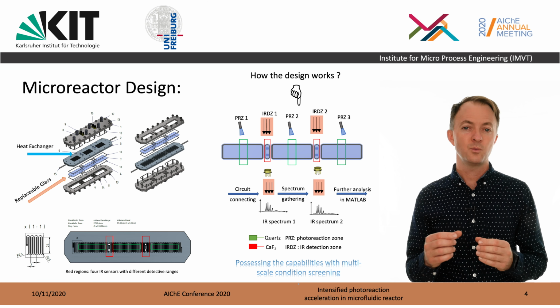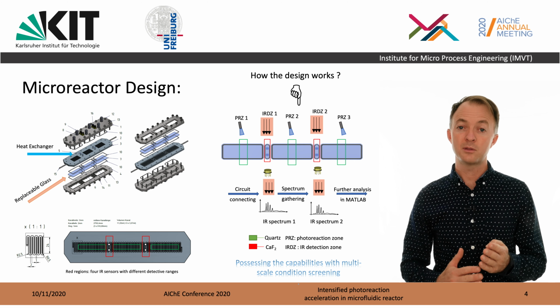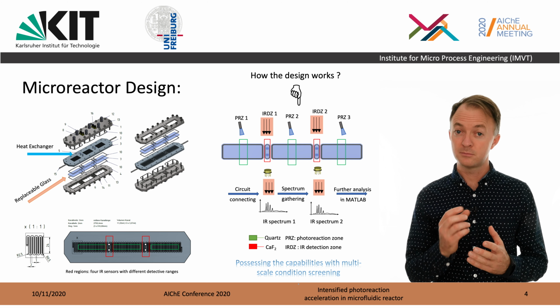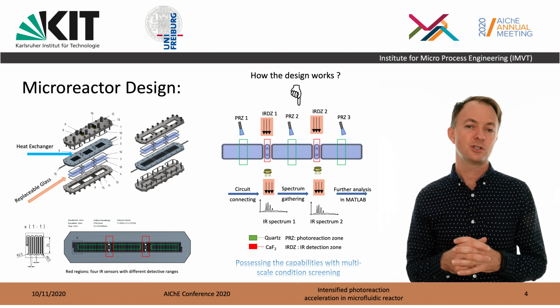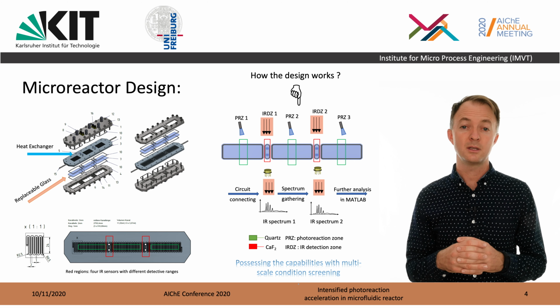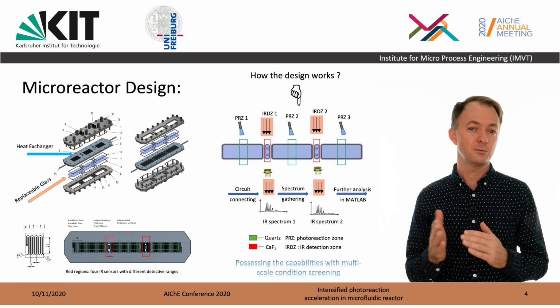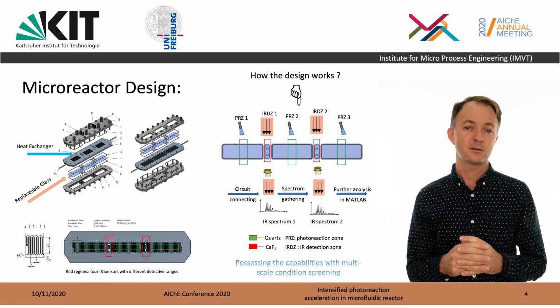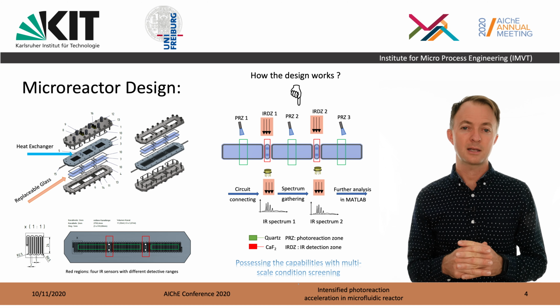And in between each zone, we have built in the sensing regions. So these are the regions where we will illuminate with broadband infrared light and actually have our special sensors on the other side. A very nice feature is that we have this integrated 3-zone heat exchanger. So for each of the reaction zones, there's an individually controllable heat exchange zone that has its own inlet and outlet of cooling water or heating water, depending on what region we want to operate that part of the reactor in.